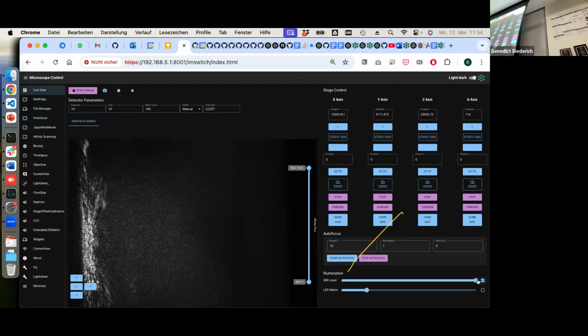If you talk, would it pick up the vibrations of your voice? Yeah. So also when you're touching the table, that's every motion here. If you have what's called a solder iron, because if you heat up one of the elements here, it's expanding.